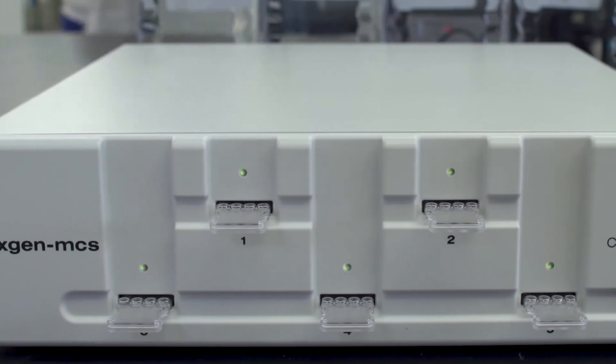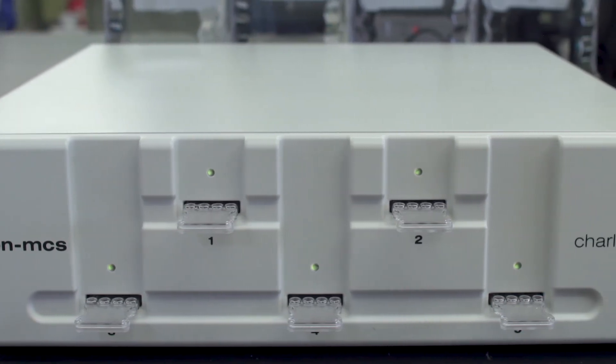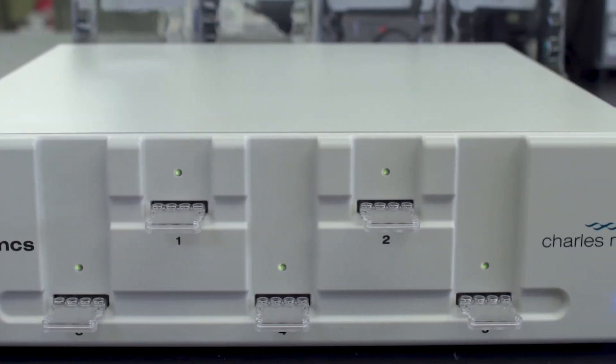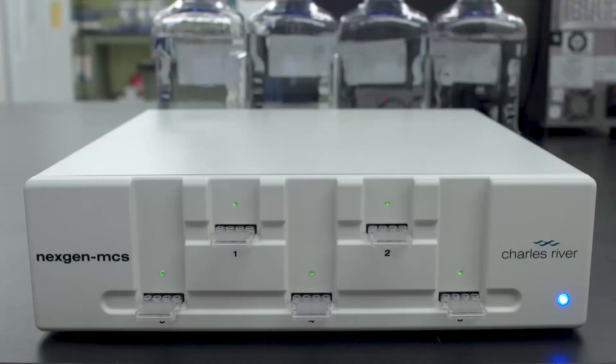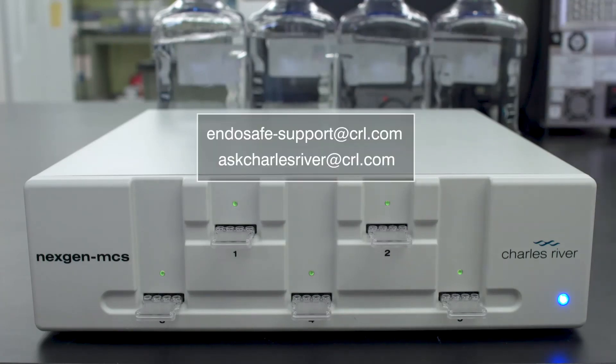The EndoSafe NextGen MCS is the ideal benchtop system for efficiently, accurately, and rapidly detecting endotoxin in multiple samples simultaneously. Contact us today to discover how easy it is to transform the way you manage your endotoxin data and maintain a centralized state of control throughout your manufacturing facility.